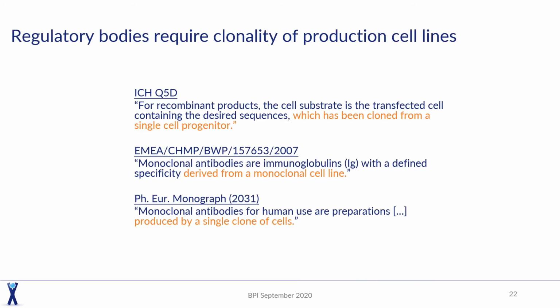So then on clonality, this is of course a topic that has gained a lot of interest over the last few years. This is again a regulatory requirement. I've just listed a few quotes here for some of the guidelines by the FDA and EMA.